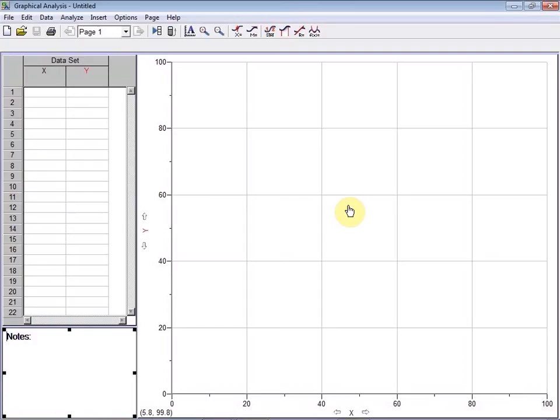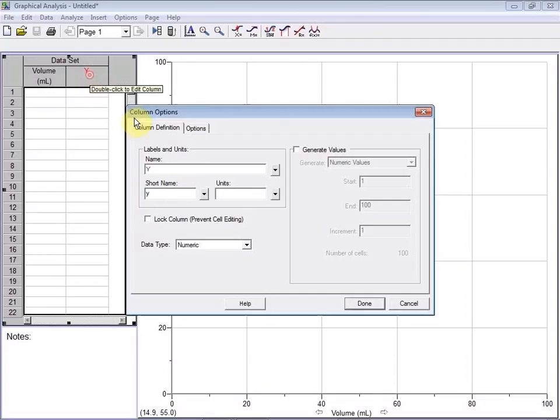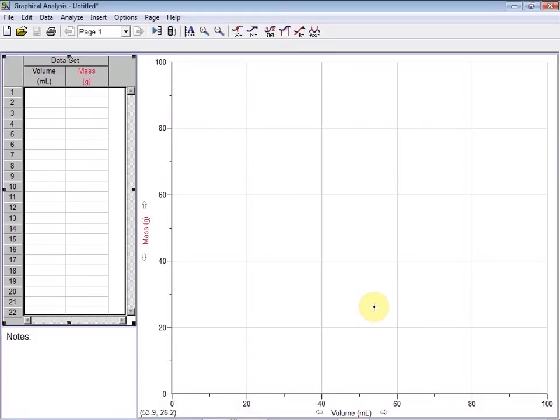Let's begin by inputting some experimental data over here in the data table. By double-clicking on the X column, we get the column options window, where we can give our independent variable a label and a unit. The same applies for the dependent variable. Data can be entered manually, and it automatically populates the graph, which automatically scales the axes.